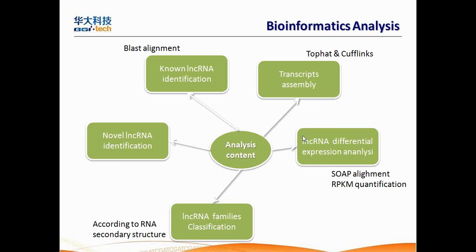And also, after we've got the annotation of long non-coding RNA, we can calculate the expression level and compare the expression level of long non-coding RNA in different samples.